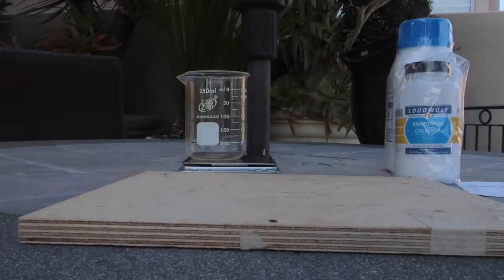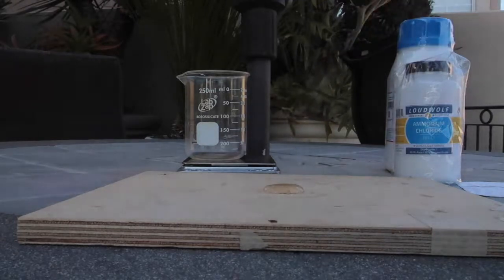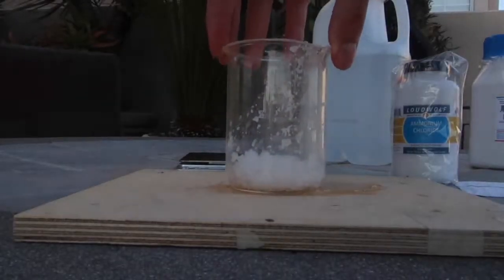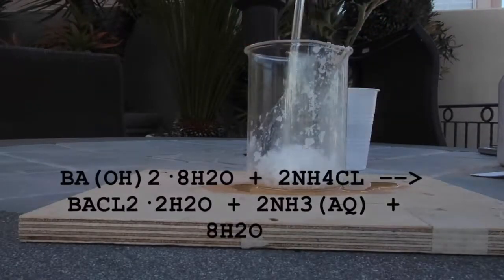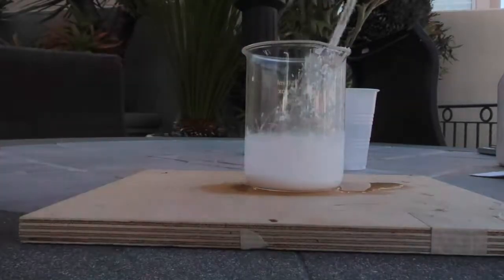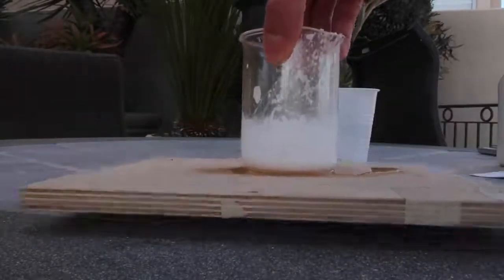An endothermic reaction is a reaction that gets colder as it proceeds instead of heating up like most do. For this experiment, I added some water onto a wooden board. On top of that, I added a beaker filled with 32 grams of barium hydroxide octahydrate and poured in 11 grams of ammonium chloride. I mixed the two together for about a minute and ice crystals began to form inside. When I tried picking up the beaker, the water I had put in the beginning had frozen the block of wood and the beaker together.